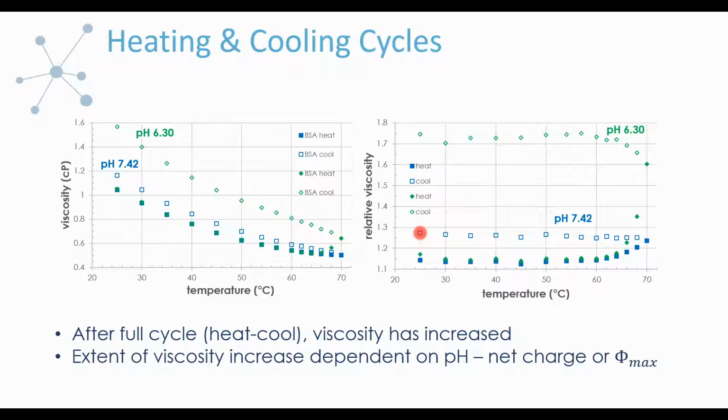One thing that is expected to stabilize proteins are various types of sugars or individual amino acids. So you could also look and see how this transition changes with other components. We just wanted to initially do this experiment with adjusting something that was well documented in the literature, and that would be the pH and how it relates to charge density and then the electrostatic repulsion magnitude.